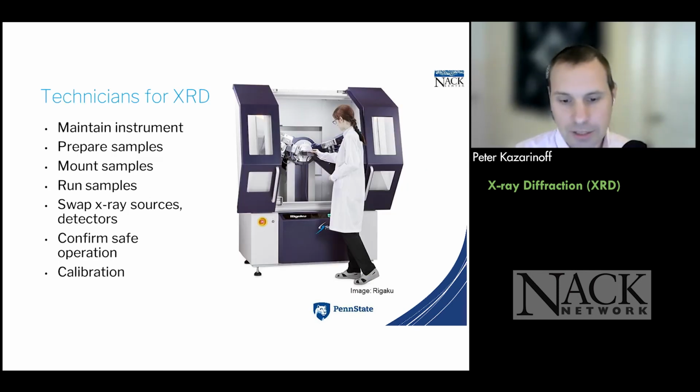I teach technicians at Portland Community College, and so for thinking about teaching technicians about XRD, the kind of things that they might do with it include maintenance of the instruments. They might prepare samples, like I'll show you in a sec.